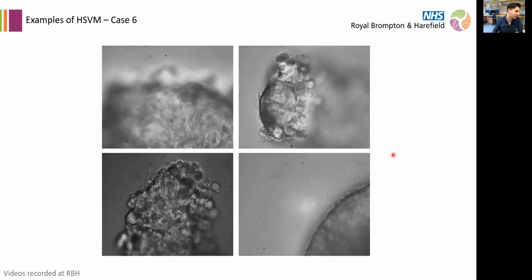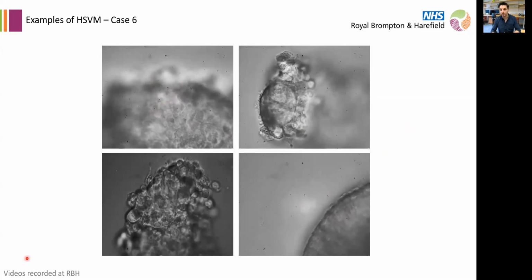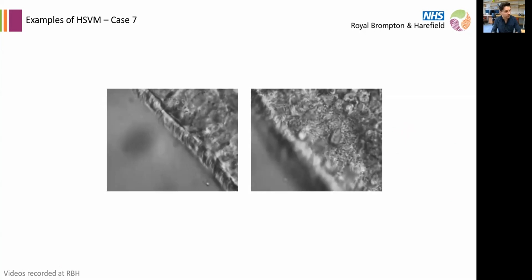So yeah, I agree that this looks slightly reduced around here. This looks somewhat normal actually. And here it's a little bit blurry, but we also see some kind of rotational pattern. And so it's actually also a central pair defect. So let's go into slightly harder ones. What do you think of this patient?